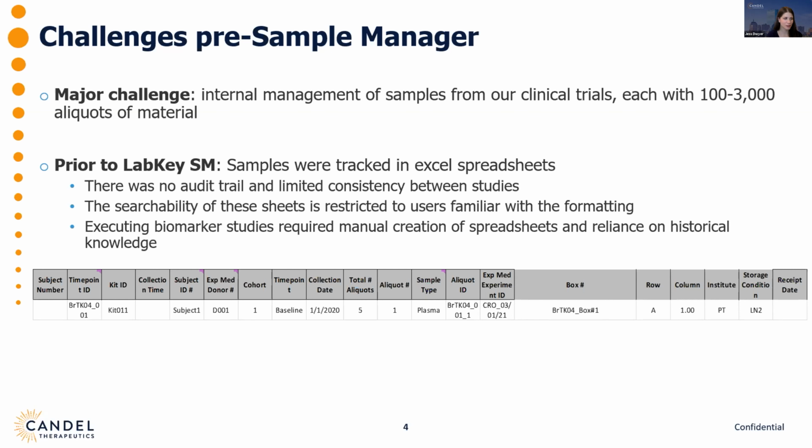sent. So here, you'll see an example of one of our curated spreadsheets that will be imported into Sample Manager. This has all the data that we need to be capturing, which I can look at and totally know what's going on, but isn't as readable to anyone else looking for some summary information. So I would spend a lot of time making pivot tables and summarizing the data from these spreadsheets for my colleagues.